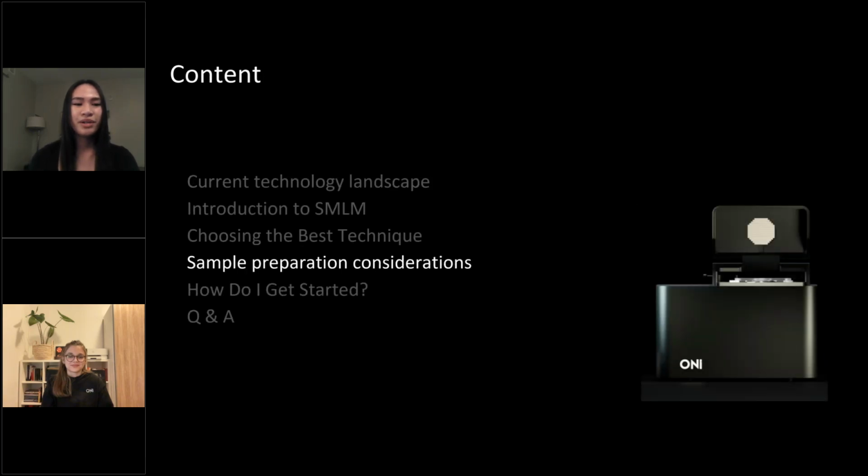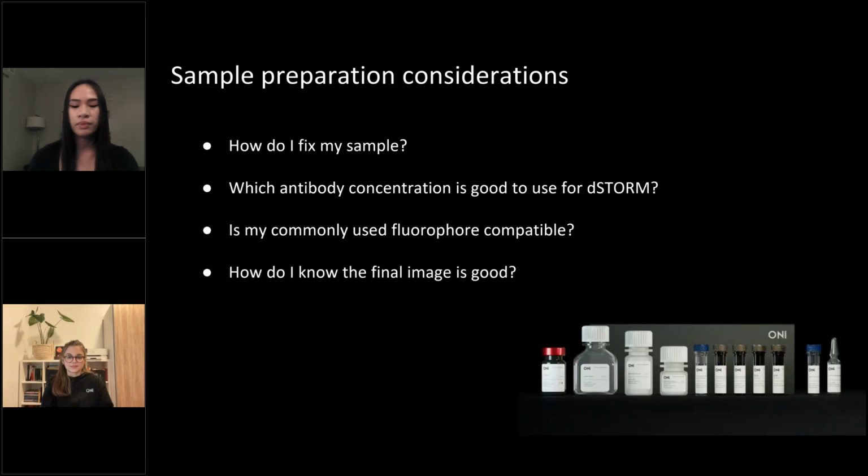All right, so now that we reviewed how to choose your best technique, the next consideration is sample preparation. And sample preparation is very important when you're doing any sort of single molecule localization experiment, just because there are a few things you need to consider.